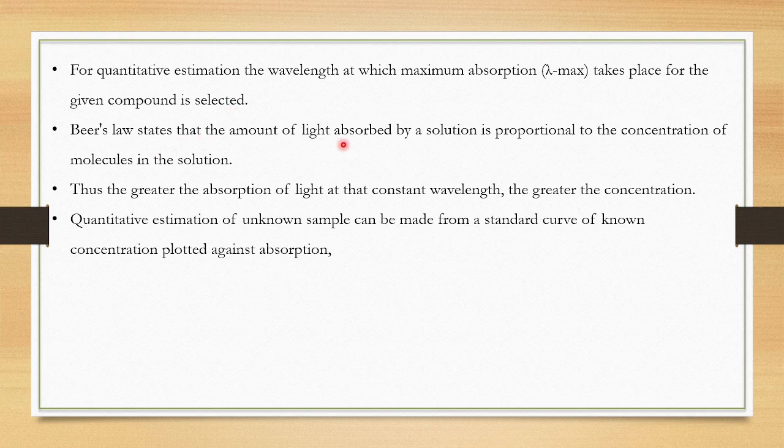This law states that the amount of light absorbed by a solution is proportional to the concentration of molecules in the solution.